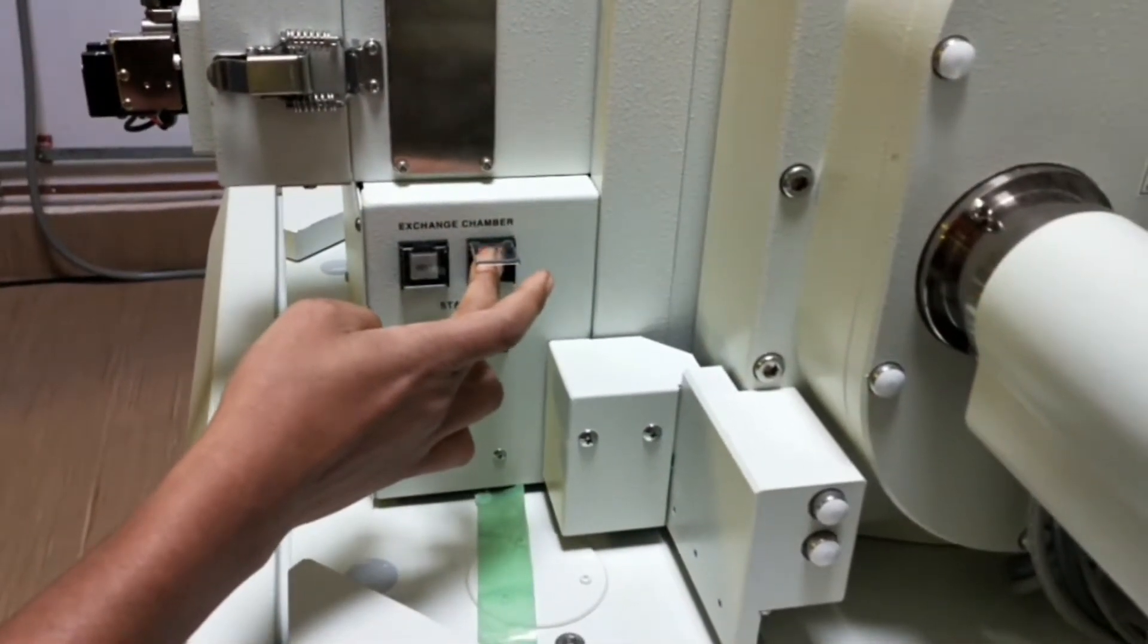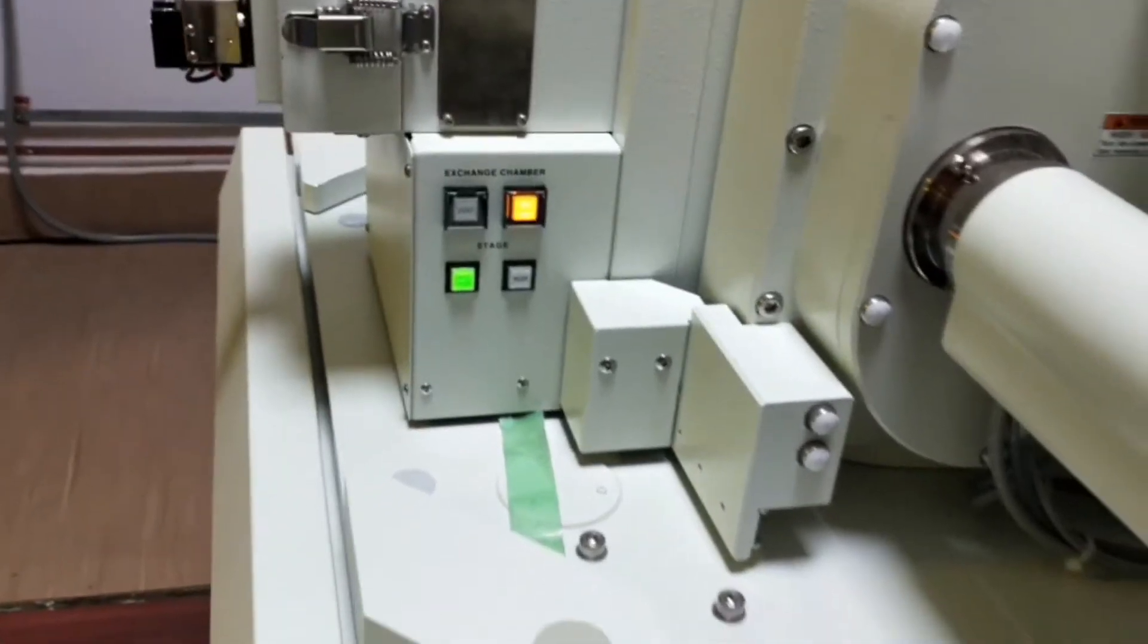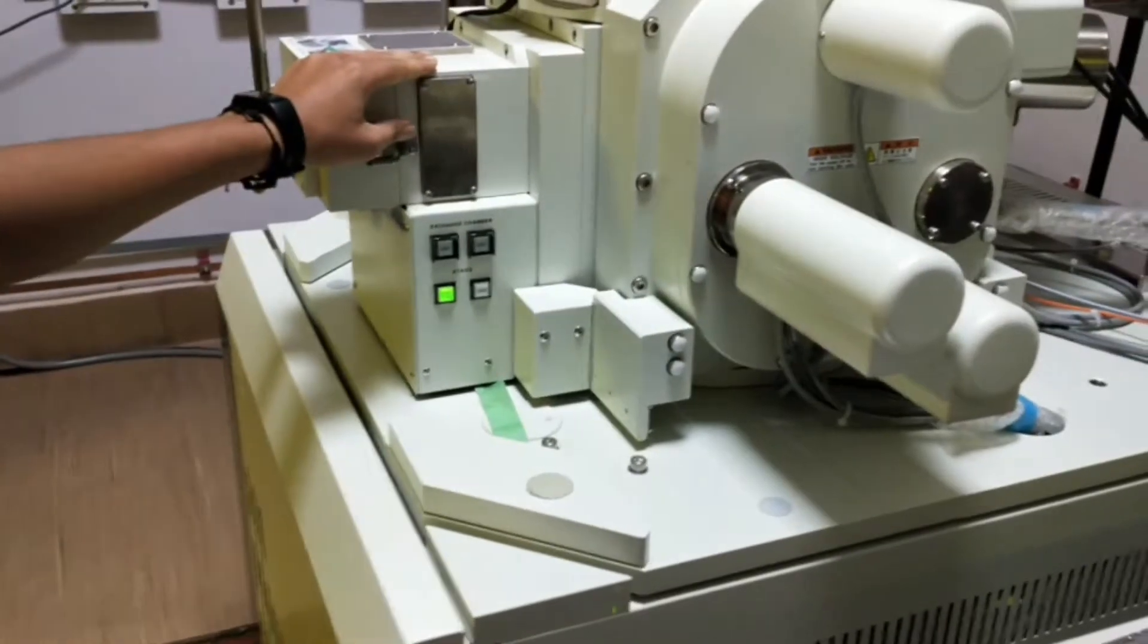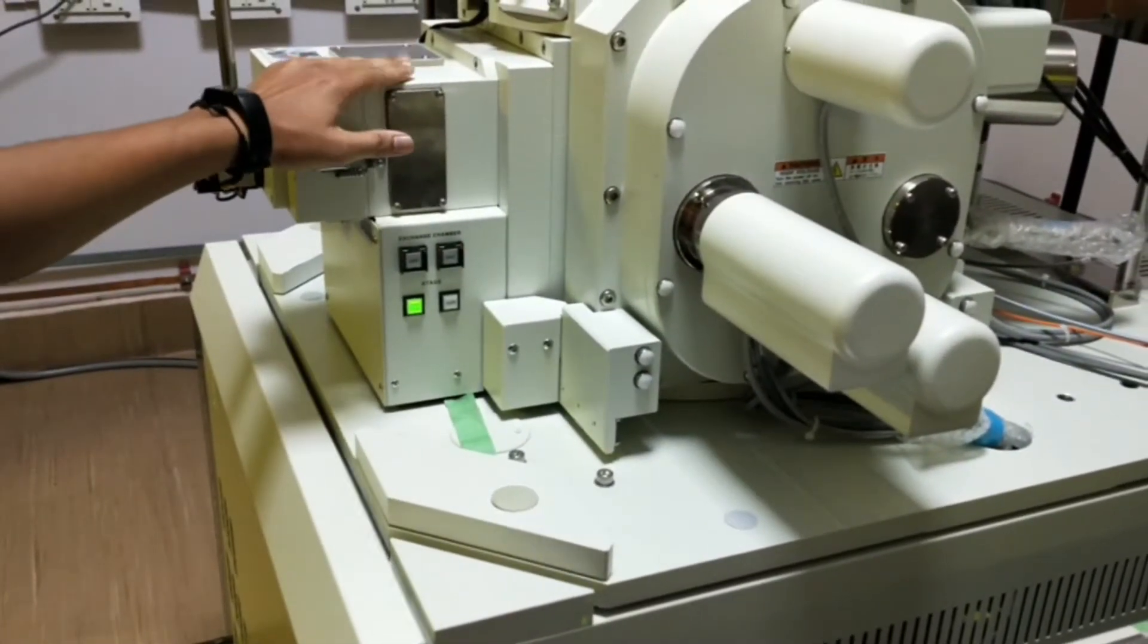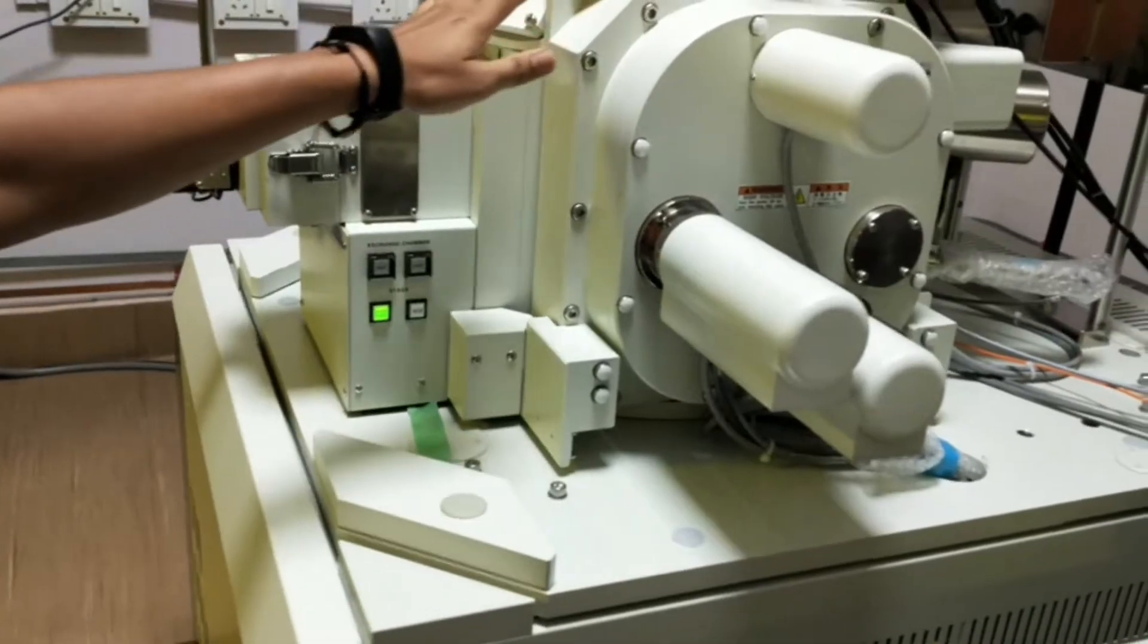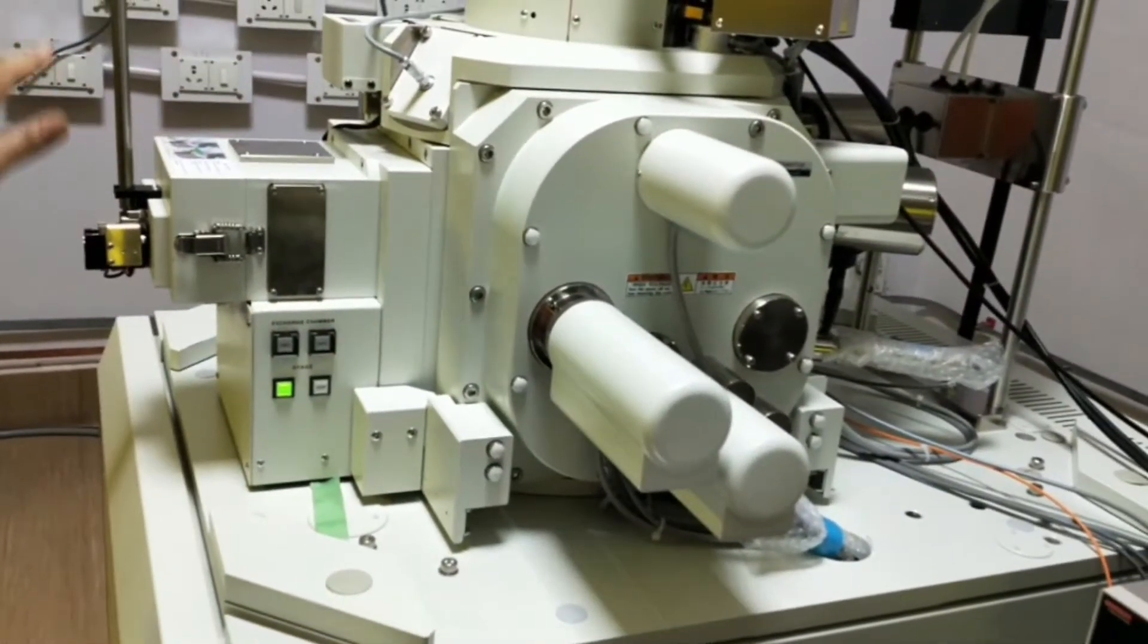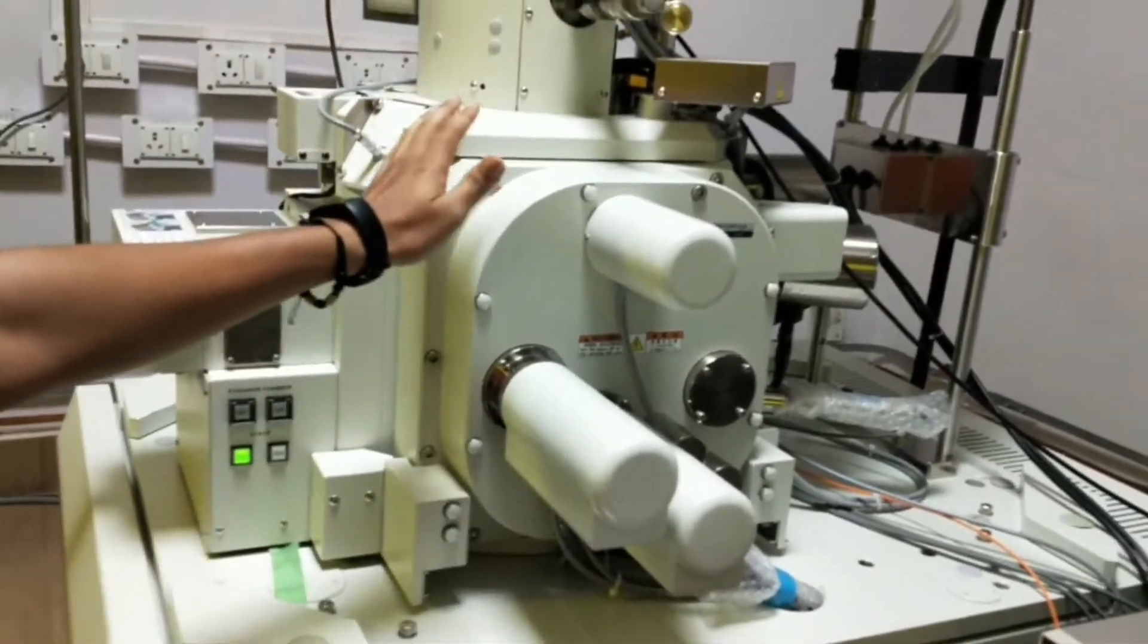Once we keep our sample, then we again have to vacuum the whole chamber along with the specimen chamber. Once the specimen chamber's pressure comes near to the inside chamber, then only we can insert our sample from this specimen chamber to the inside.